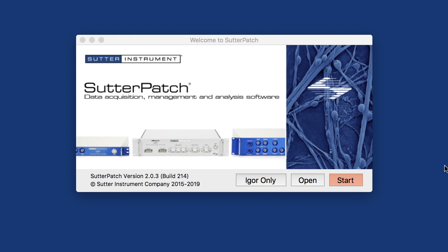This is a walkthrough of Sutterpatch data acquisition, management, and analysis software. We are now at version 2.203, and I will give you an introduction — walking you through the general look and feel of the data, how you can navigate through the data, zoom in, zoom out, visualize the data, and then I will show you how you can acquire data and do certain types of analysis to give you an overview of some of the program features.